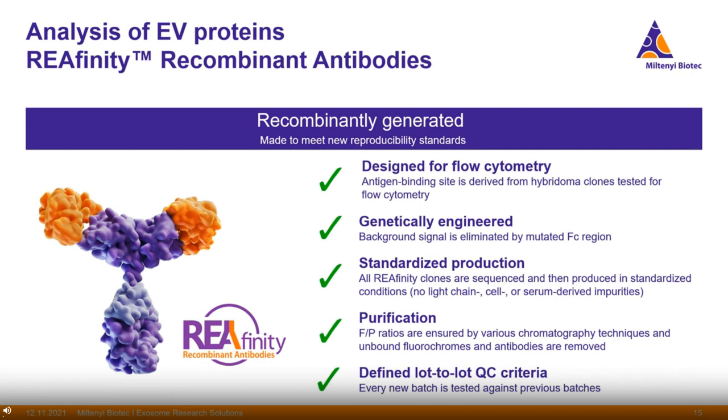And because of all these advantages, flow cytometry holds great promise for also being used to analyze EVs. Next to the flow cytometer itself, the most important component of a flow cytometry experiment comes down to the antibodies. By using highly specific antibodies, which are conjugated to fluorescent markers, it is possible to identify and quantify the target of interest.